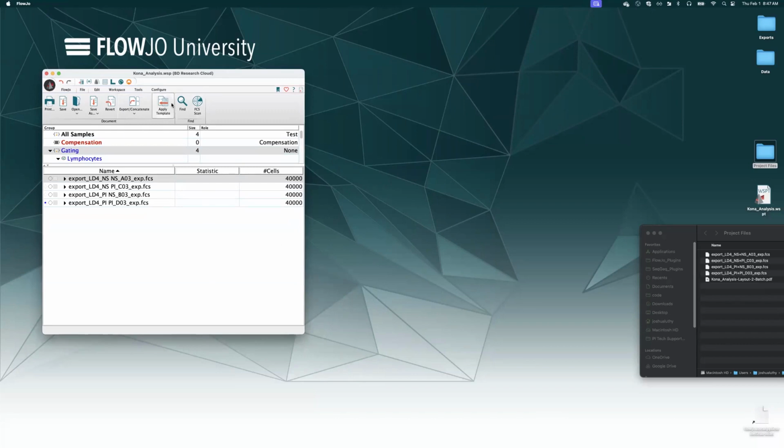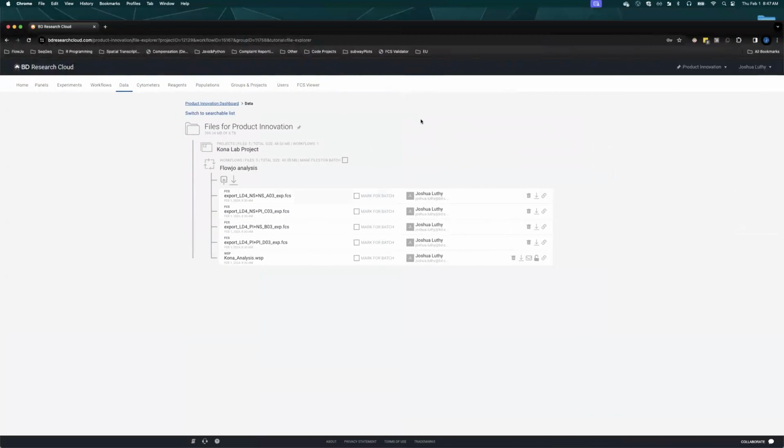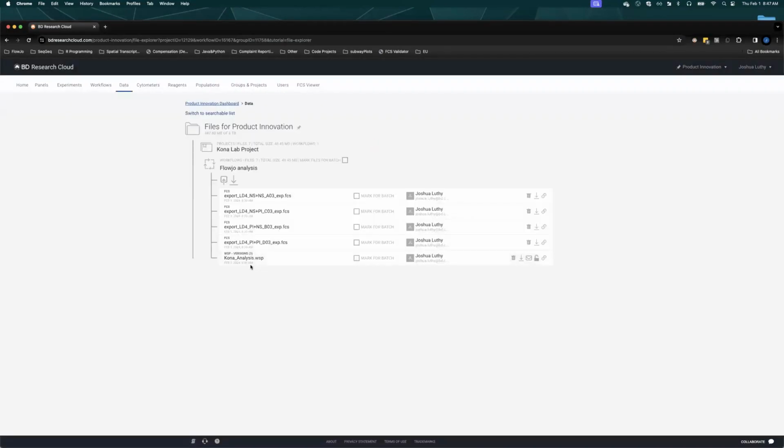Okay, so I've got that analysis that's been saved and uploaded back here. So maybe if I refresh, I'll see a timestamp update. Yeah, 8:45.